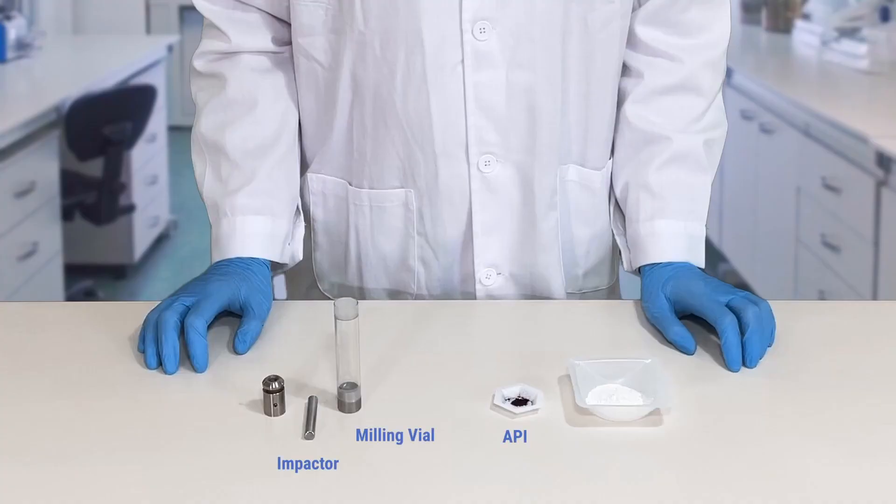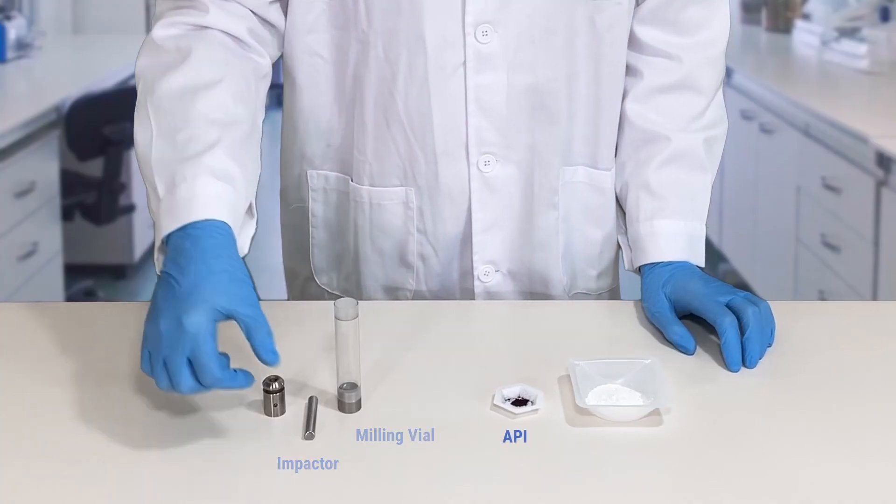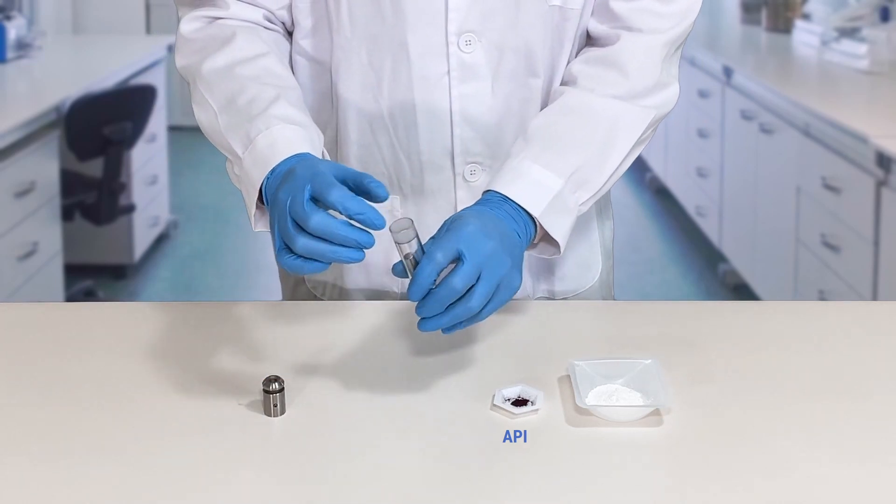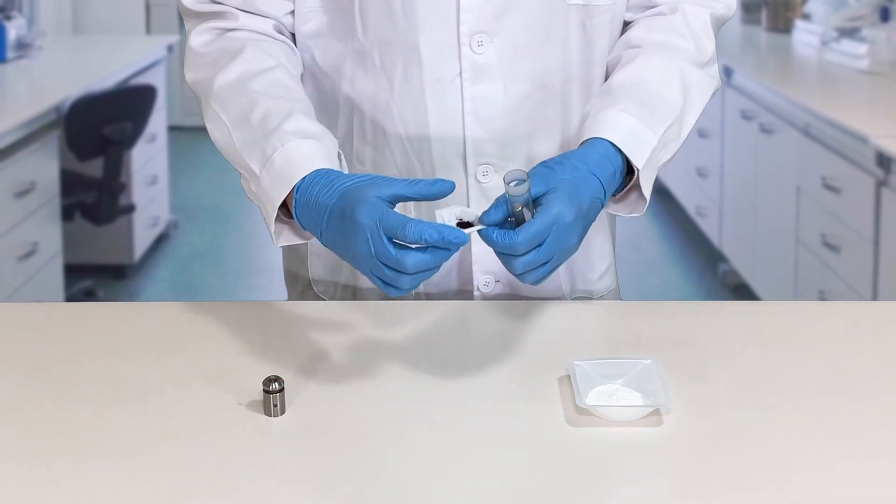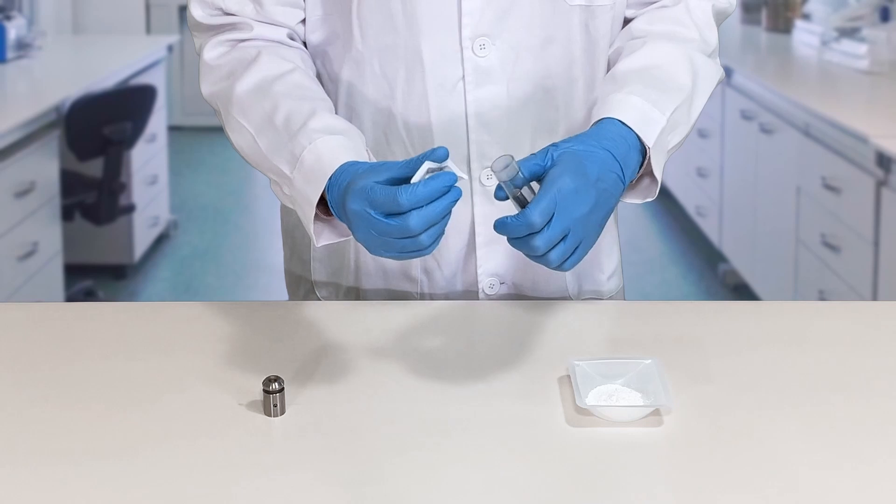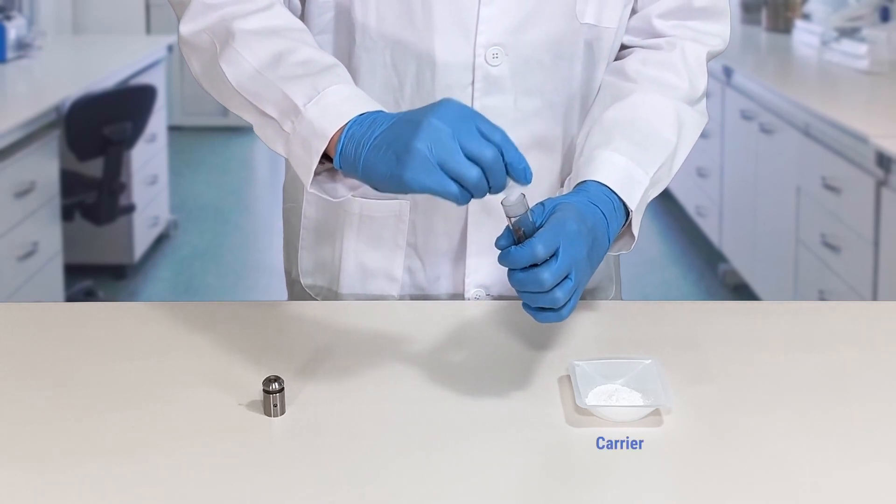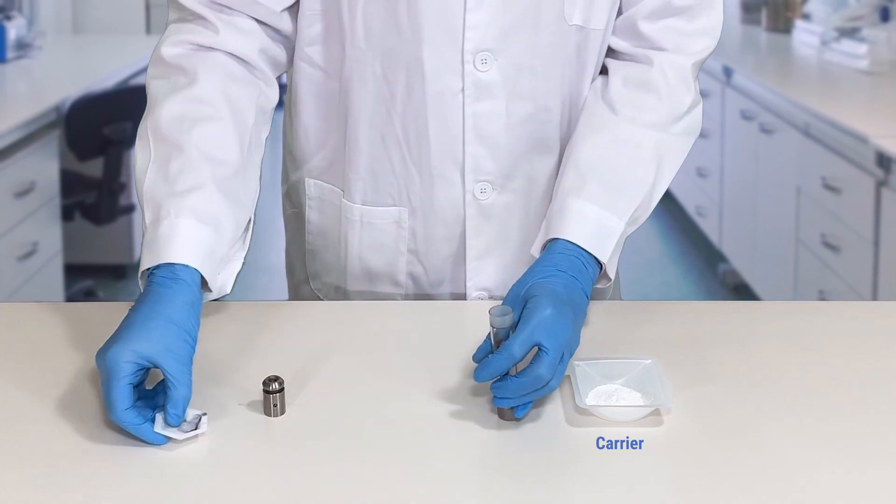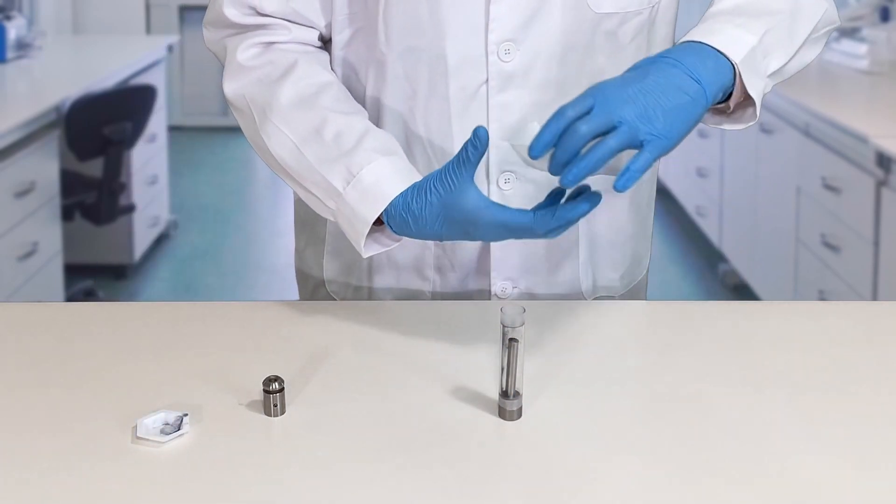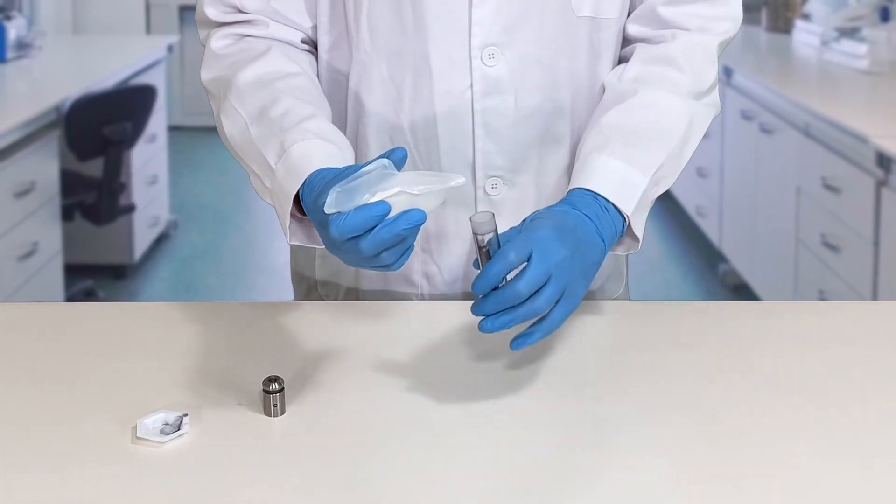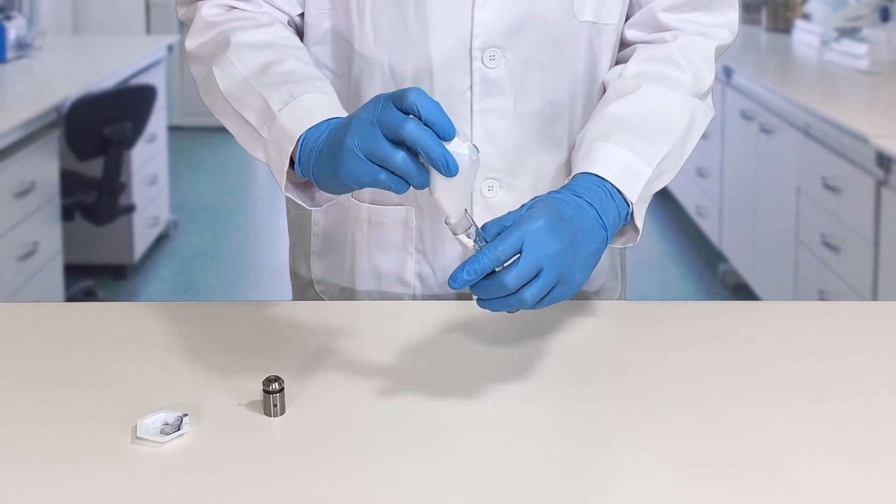Here you can see the parts of the milling vial. The assembling starts by inserting the impactor into the milling jar before adding the material. Adding the impactor after filling the powdery material may cause undesired material discharge by the induced airflow. Add the pre-weighed components of your formulation to the milling jar and close it.